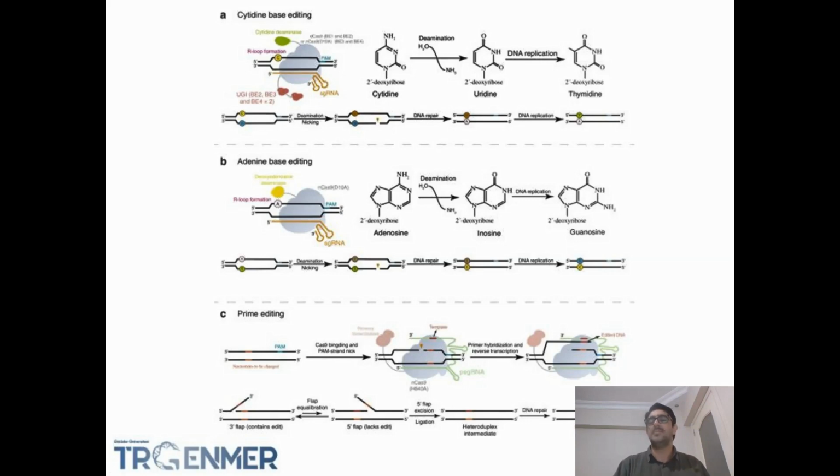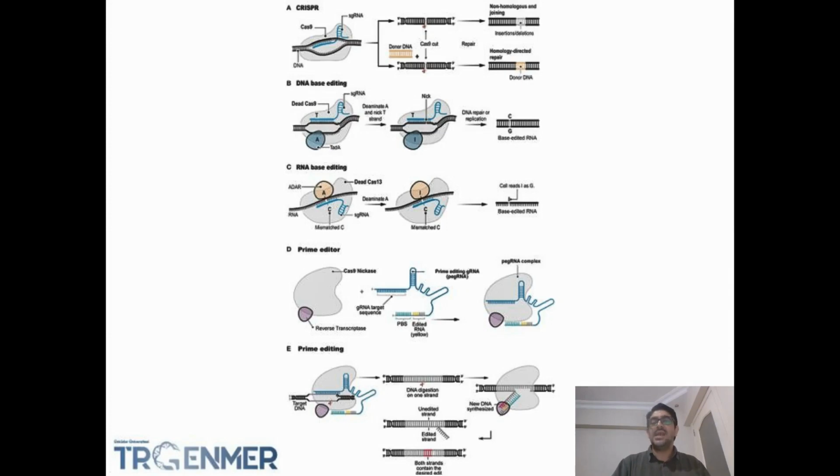With the help of this system, you can do anything similar to the base editor system, and you can even improve the insertion and deletion of sequences with the reverse transcriptase domain. And you can see here that DNA changes are not limited to the genome. Instead of using nuclease-Cas9, you can change Cas9, which binds to DNA sequences, to Cas13.